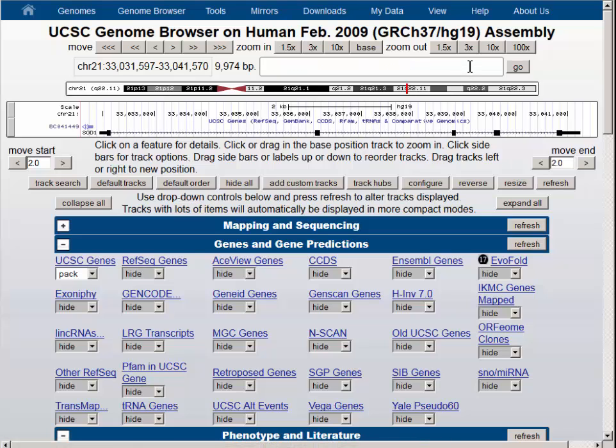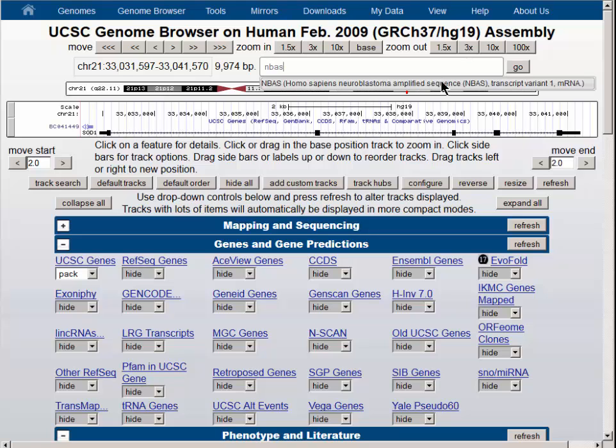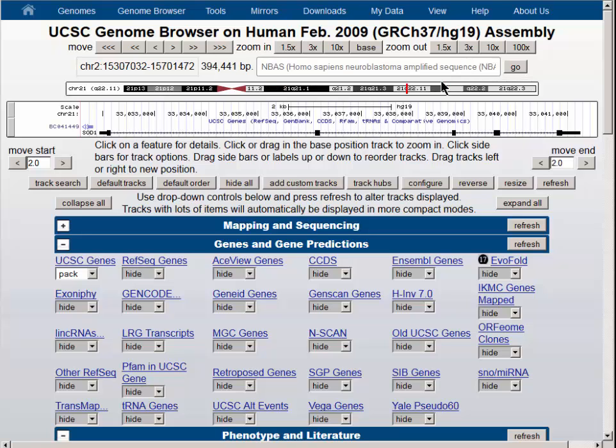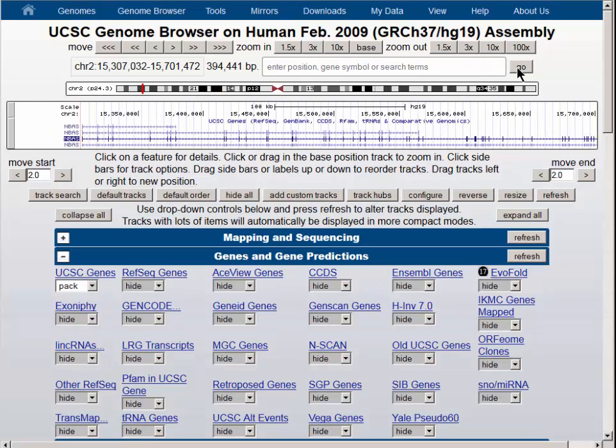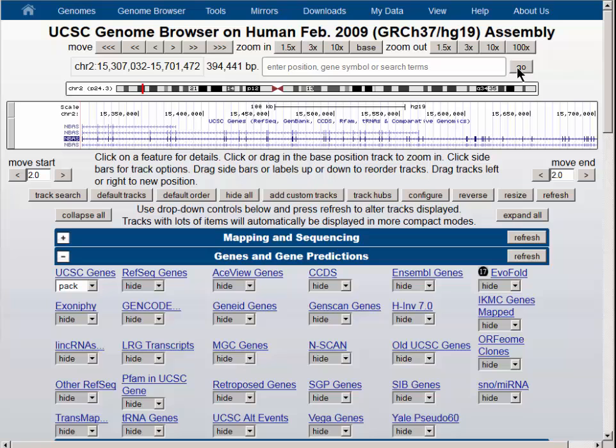Let's navigate to a more interesting location, the NBAS gene. We will type that in and then select it from the offered menu. The go button takes us to that location in the genome. The reason why this is more interesting is that it has a number of different start sites. We're going to make a custom track out of the upstream regions of the genes and then use that custom track to intersect with the SNP table from dbSNP so that we can find all of the SNPs in those regions.